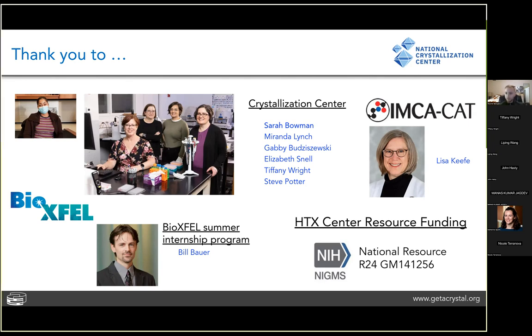I can't probably give the most informed answer to this question because I'm not one of the authors of the program. But from what I've seen, if you have a salt crystal that looks really like a regular crystal, then it might get tripped up by that, because it only looks at the bright field images. That's the only data that is being interpreted by the model.